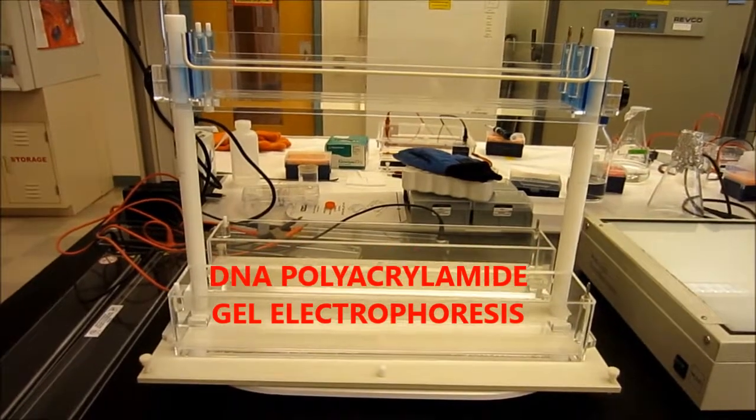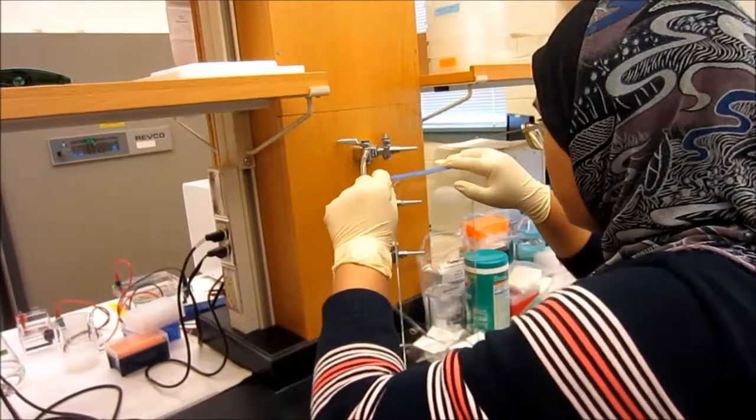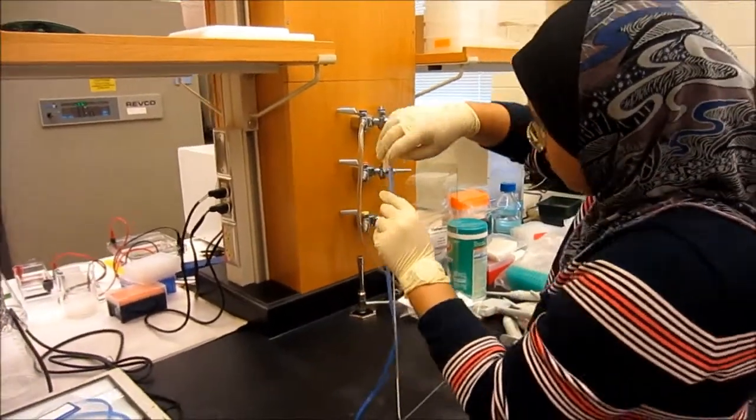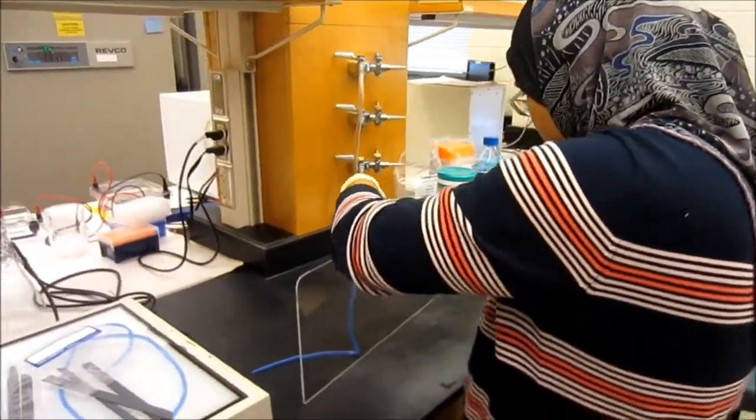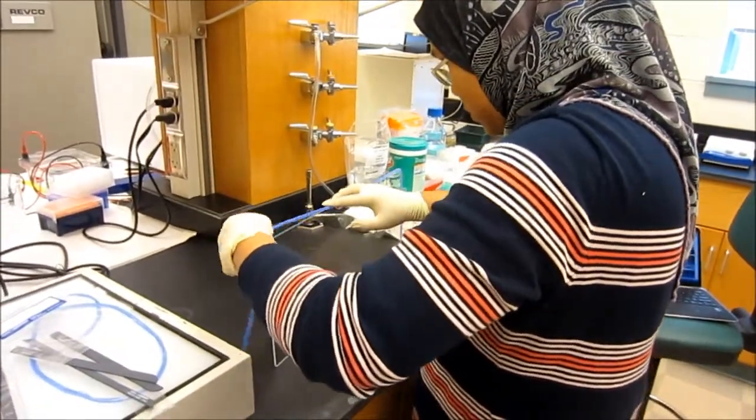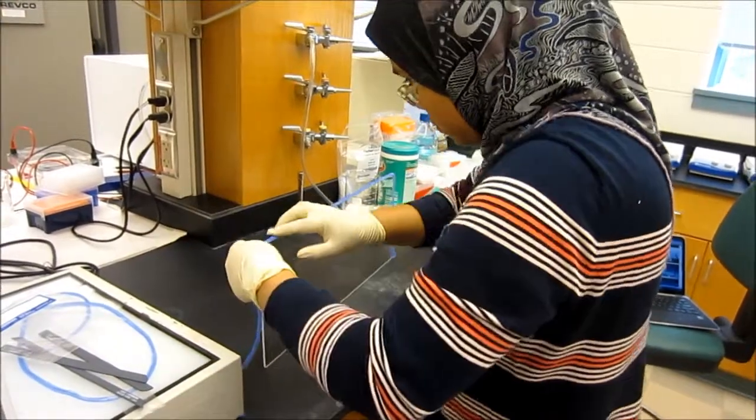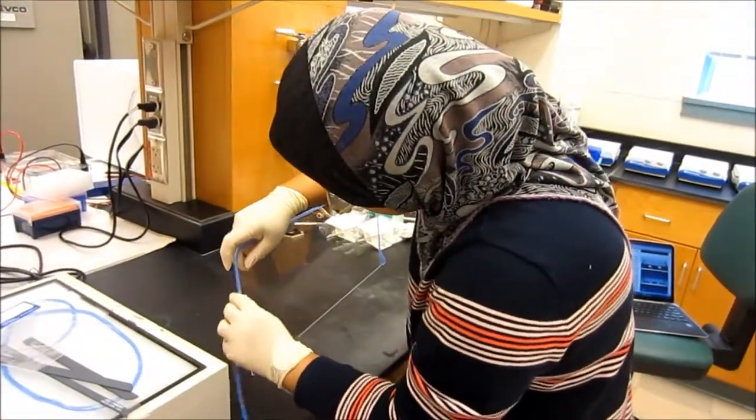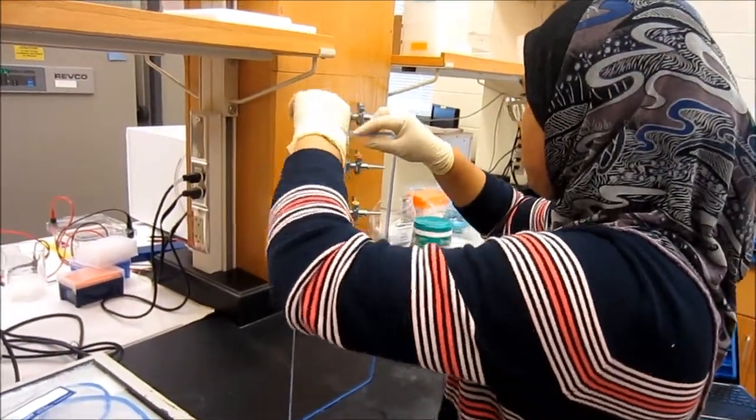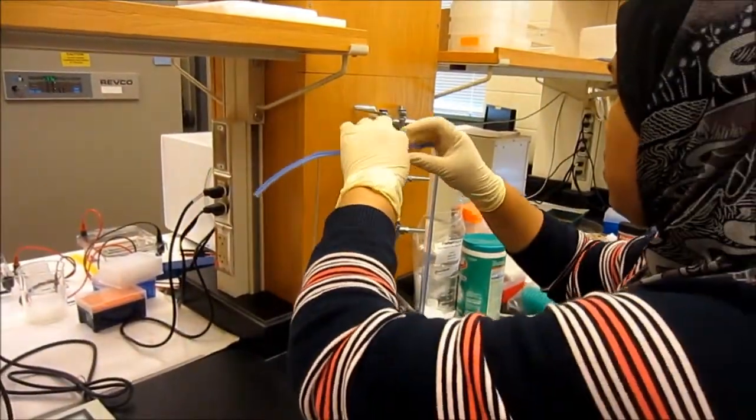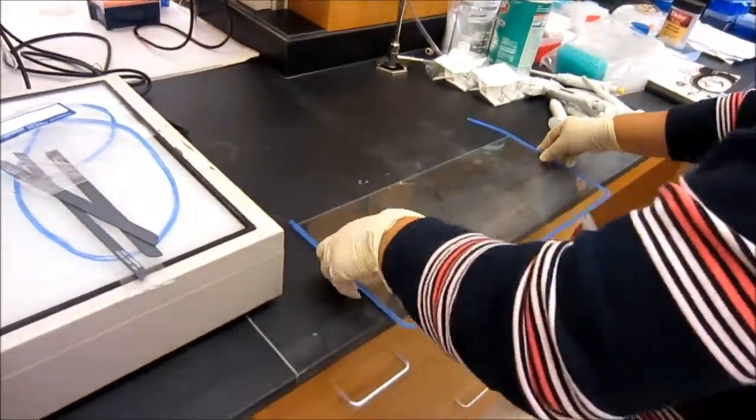DNA polyacrylamide gel electrophoresis. The first step in DNA polyacrylamide gel electrophoresis is assembling the apparatus. Here, you can see a blue tube called Gascade is wrapped around the first glass slide. Gascade is neatly applied on the glass edge. This step is important to ensure that the gel solution that will be poured later will not leak.